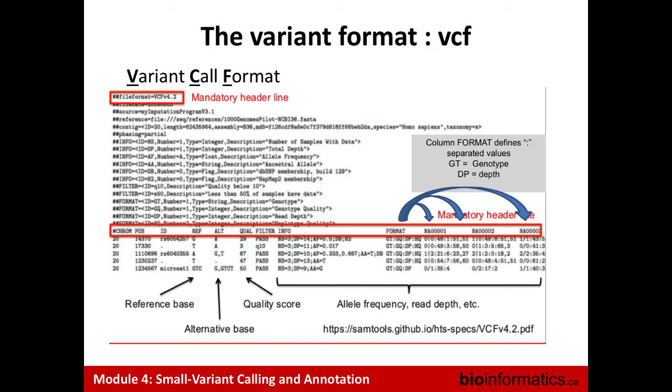I have a question about that. With the multiple samples that you talked about, what criteria would you use to determine which multiple samples you're combining together to call at the same time? Would they all come from the same library, or could you just take a whole bunch? No, you need to call samples from your own experiment all together, with harmonized libraries, sequencing, and so on. If you start to include samples with different, for example, exome kit or different sequencer, it won't work. So it should be as harmonized as possible. You do that, and after, if you want to include information from others, then you will start to do some imputation or comparison.